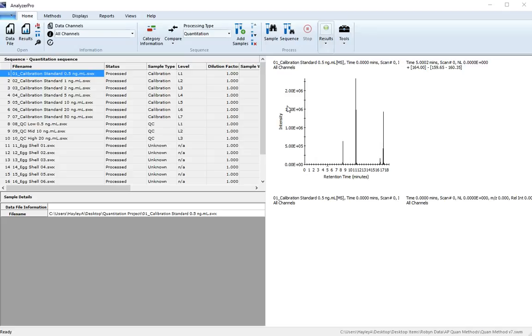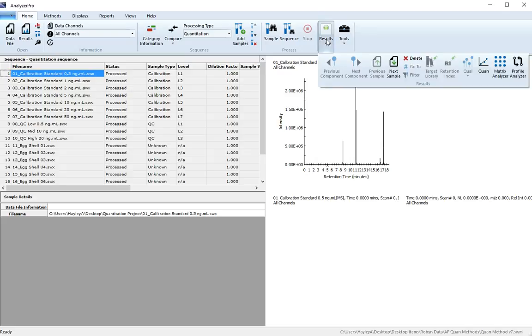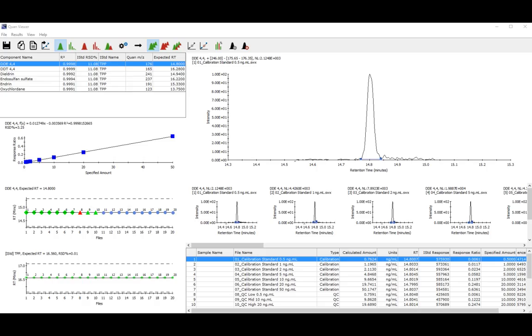Once your sequence has finished processing, you can view the results from the Results tab and by clicking Quant. The default view in the Quan Viewer is Quantitation Overview. However, there are a number of views to choose from from the View tab.